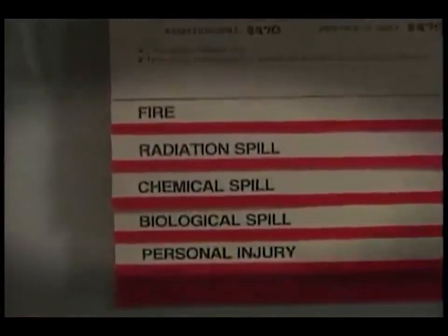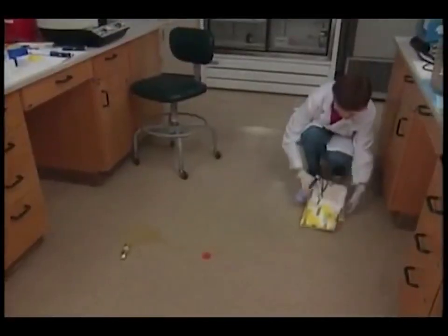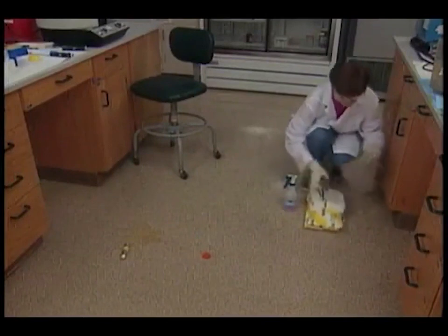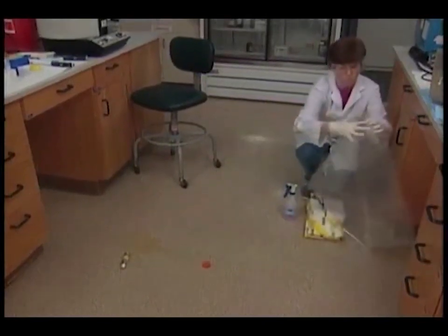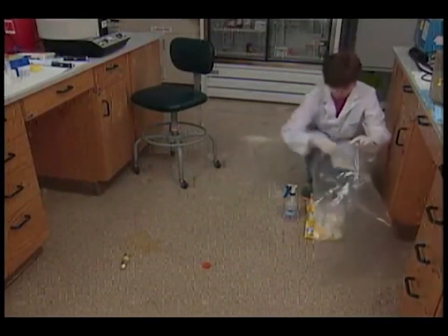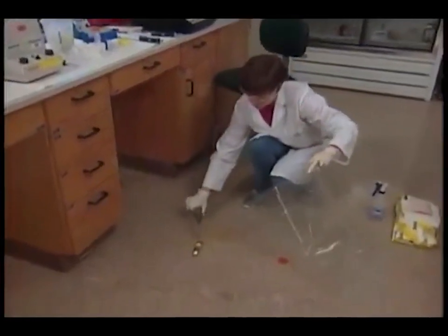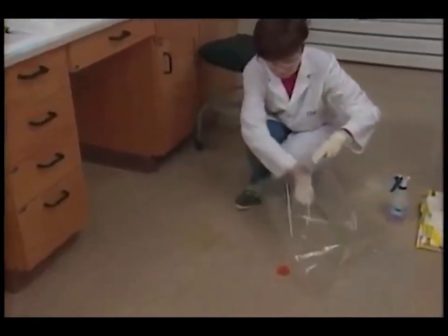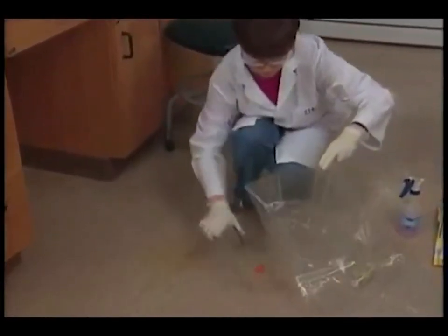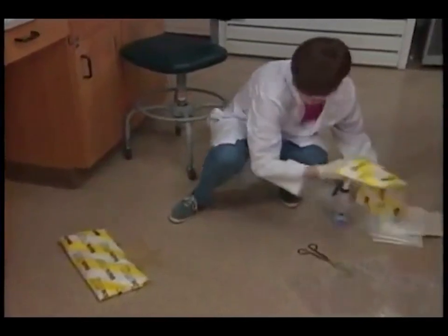How do you deal with a chemical spill? Cleaning up even a minor chemical spill should be done only by knowledgeable and trained personnel, since an incorrect procedure could cause further harm. A laboratory spill kit should include absorbents, reactants, and protective equipment, as well as instructions.